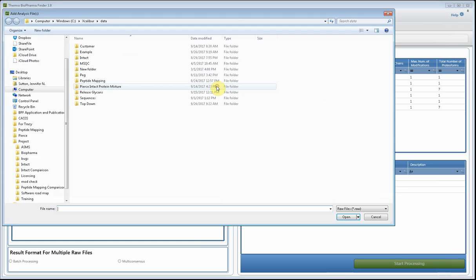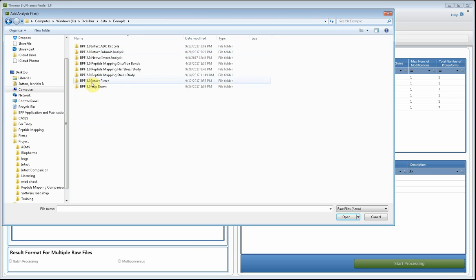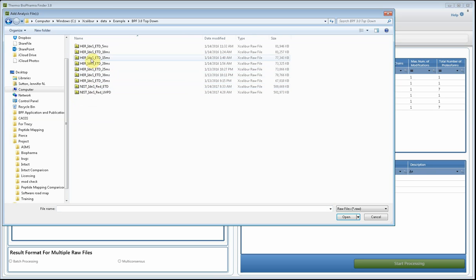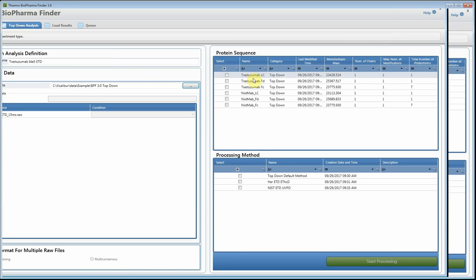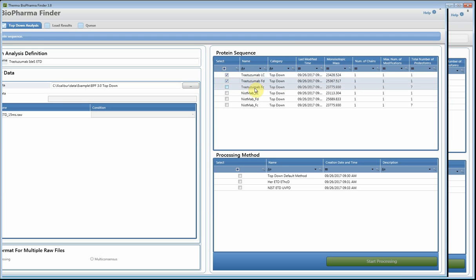I'm going to browse for my raw file and in this example I'll just bring in one raw file. In another video I'll show you how you can process all of these files and compare the results in a multi-consensus report. Let's select one for now. I'm going to choose the protein sequences — I won't show you how I generated these, as that will be covered in a different video on how to generate protein sequences for top-down.